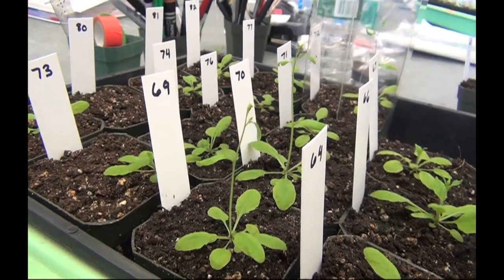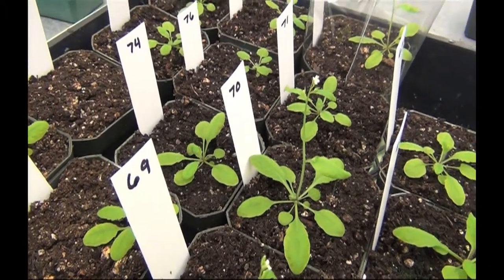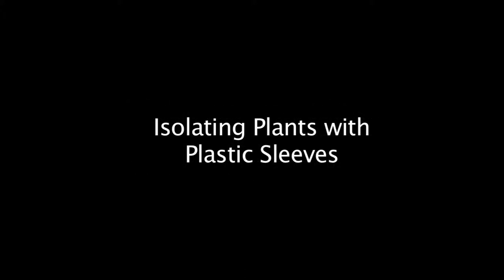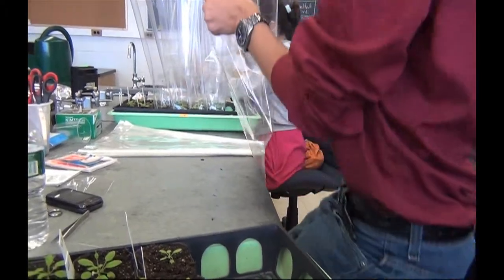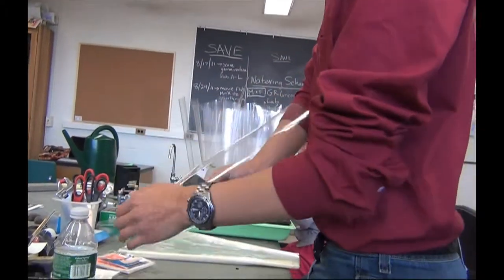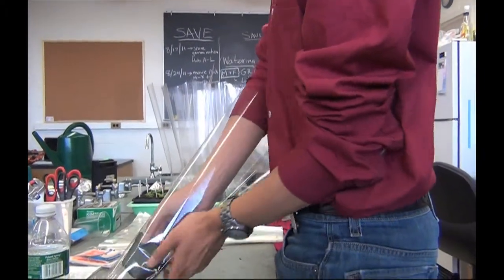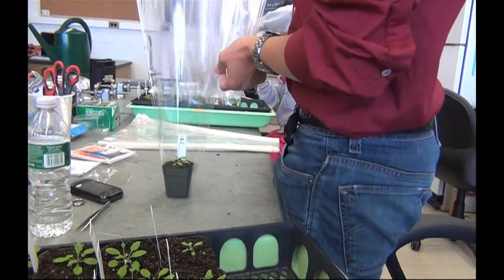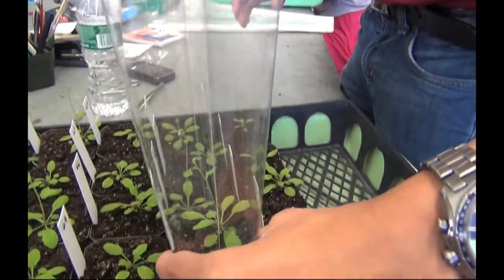In a typical round of farming, you will be growing our selected phytometer lines plus many Salk knockout lines chosen by the project PIs. Planting methods were discussed in a separate podcast. We begin this one as the plants are bolting. We want to make sure that the plants don't fertilize each other once they have flowers, so we will isolate them with plastic sleeves. You will probably have to keep checking to see which plants need to be bagged, as they may not bolt at the same time.